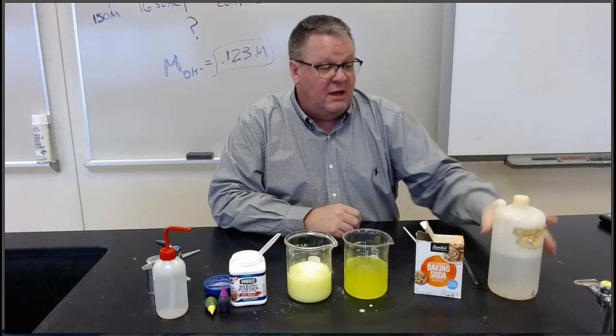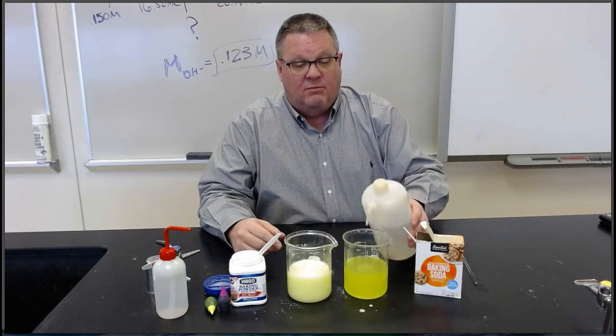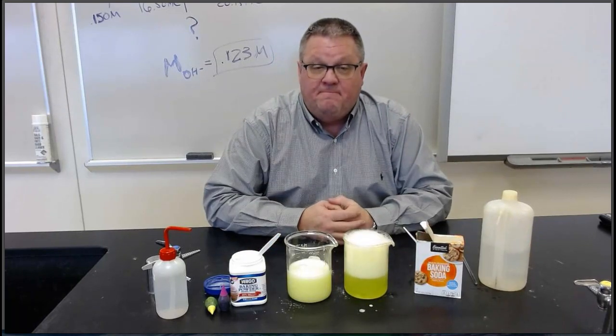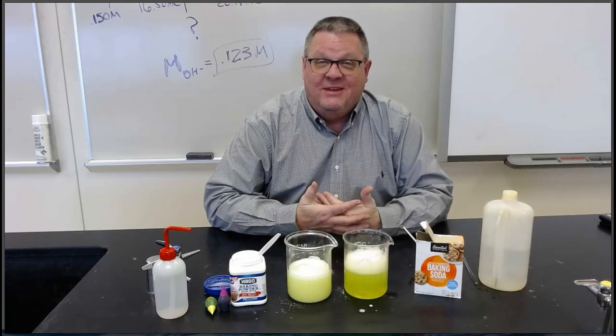Now I should be able to add acid to this baking soda, which is a base, and get bubbles to form. And you can see it does. Okay? So how cool is that? Aren't you glad you stayed around till the end?